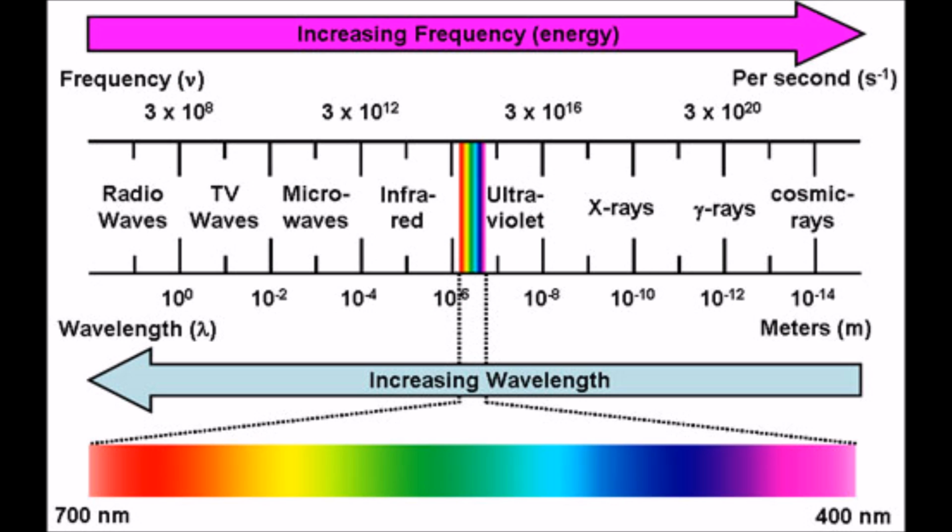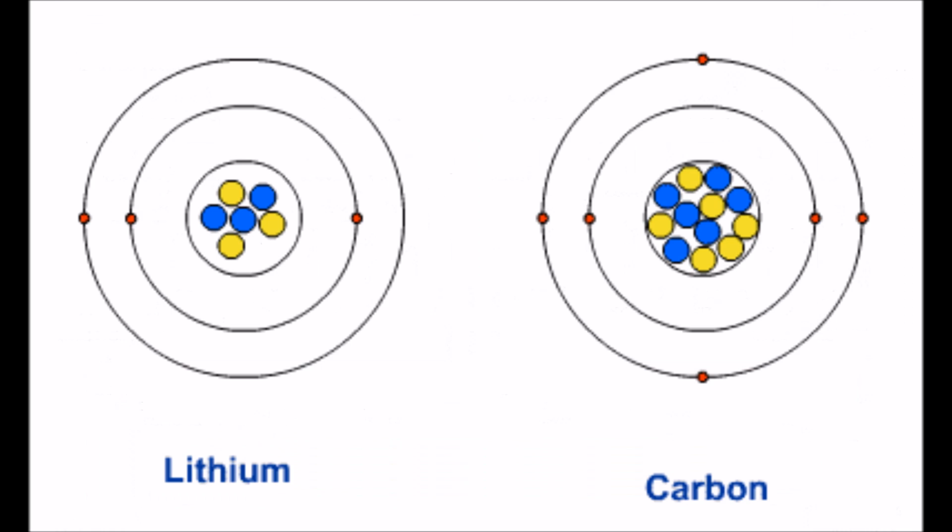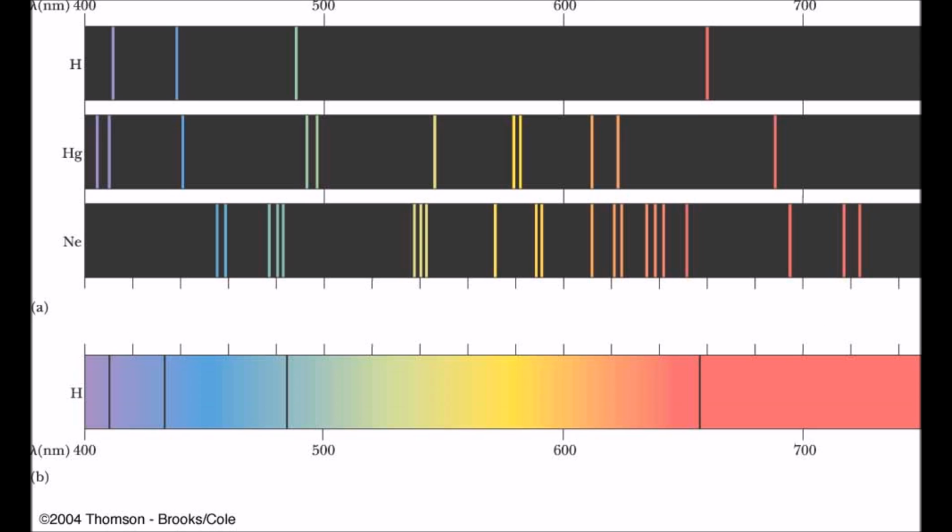The amount of energy in the photon determines its color. Red is the lowest energy of visible light, increasing energy through the rainbow of orange, yellow, green, blue, indigo, and finally violet for the highest energy of visible light. The arrangement of electrons in an atom determines the sizes of the quantum jumps, and thus the energy and colors of the collection of photons emitted, known as the emission spectrum. In this way, the emission spectrum serves as a fingerprint of the element to which the atoms belong. We can view the emission spectrum of colors all at once with the naked eye. It will appear to be one color, which we will carefully describe.